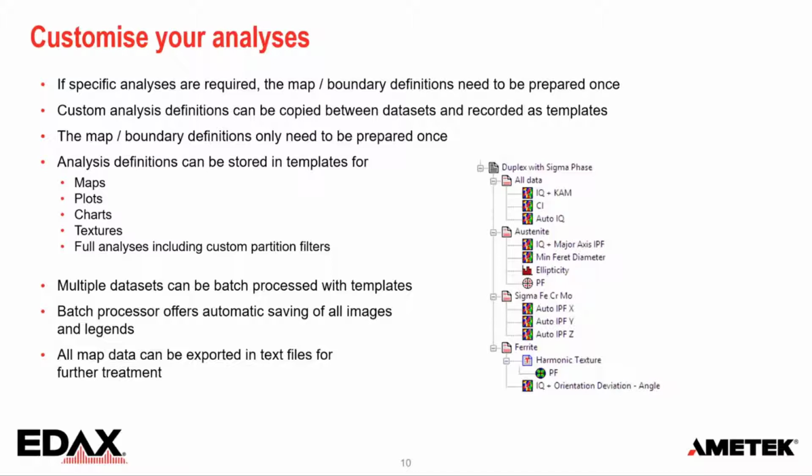And an additional thing that may not be that well known is that everything we do, all the maps, plots, charts, you always have an option to export the original data. So if there is something that you want to do your own calculations on, or you want to import it into some other program, you can always access all the data.